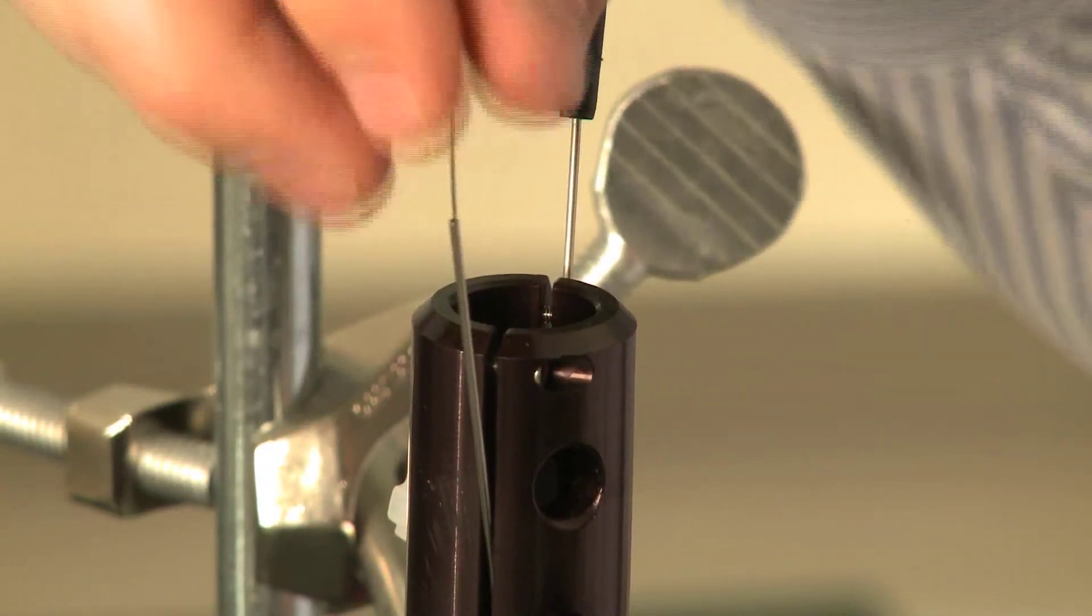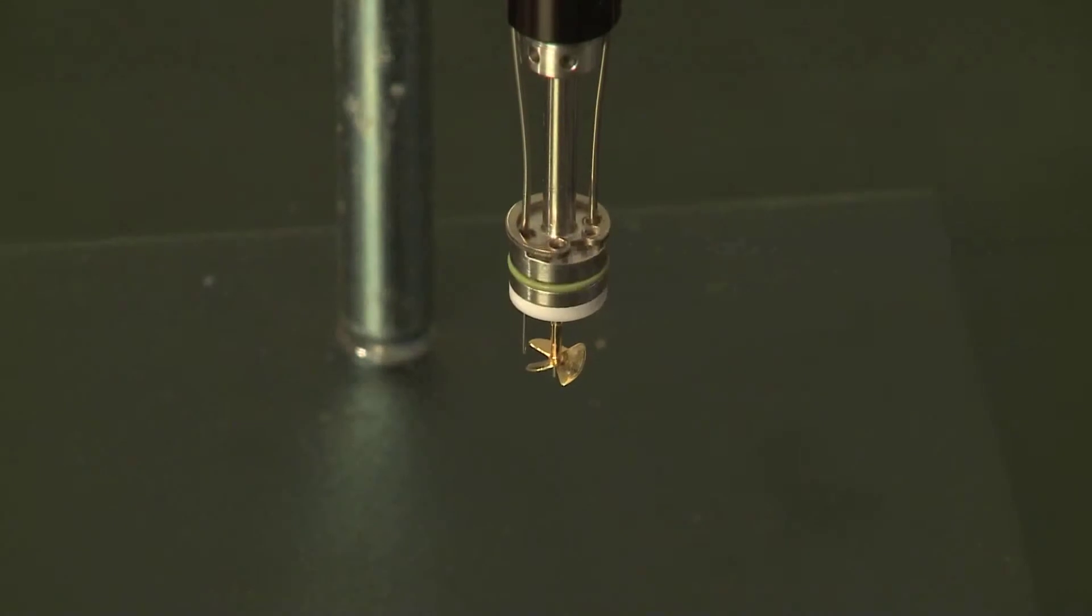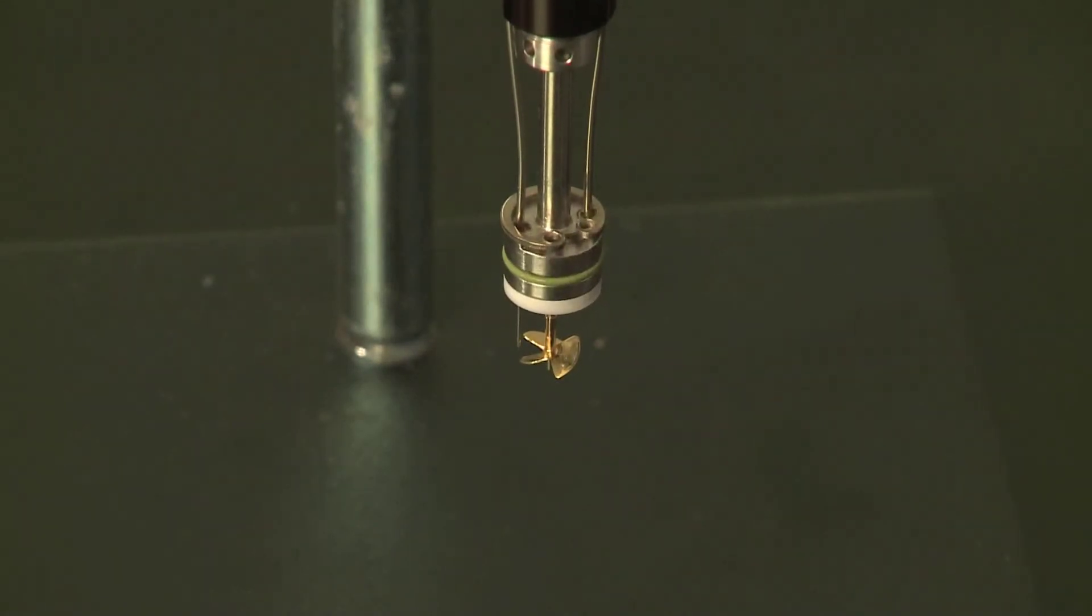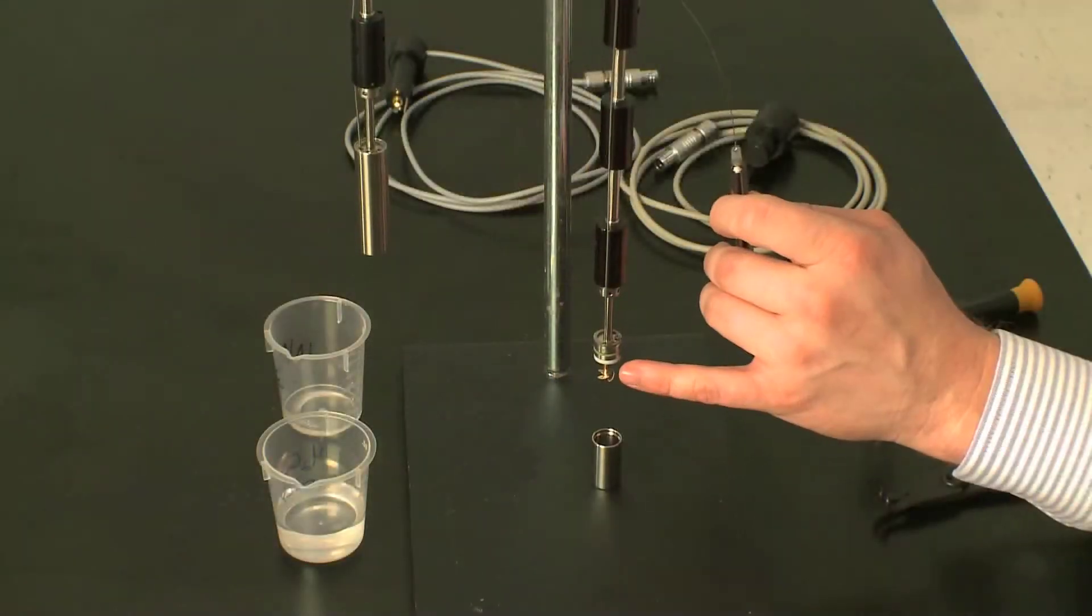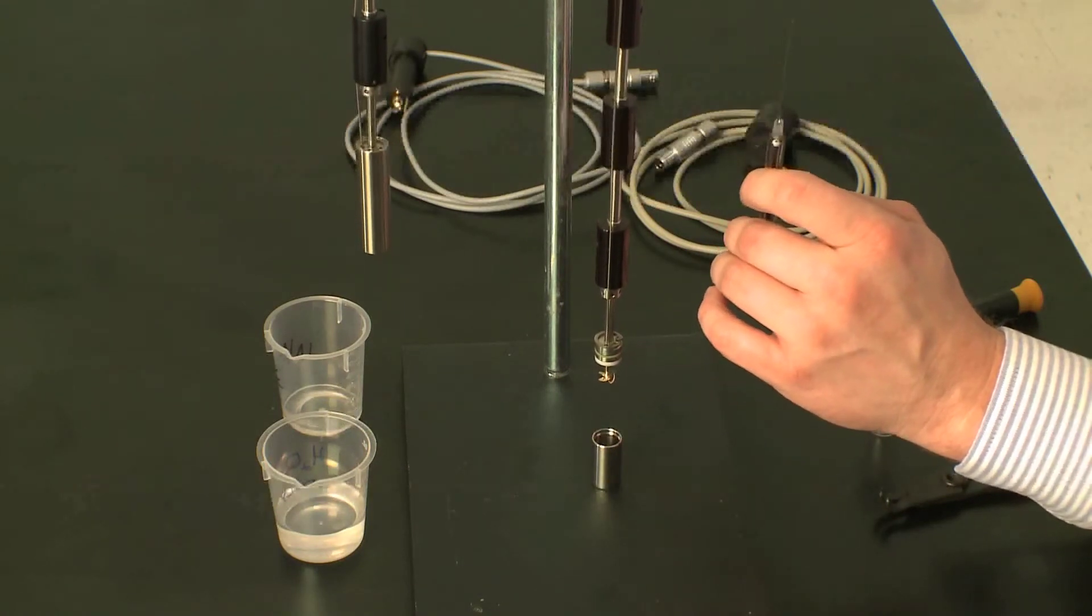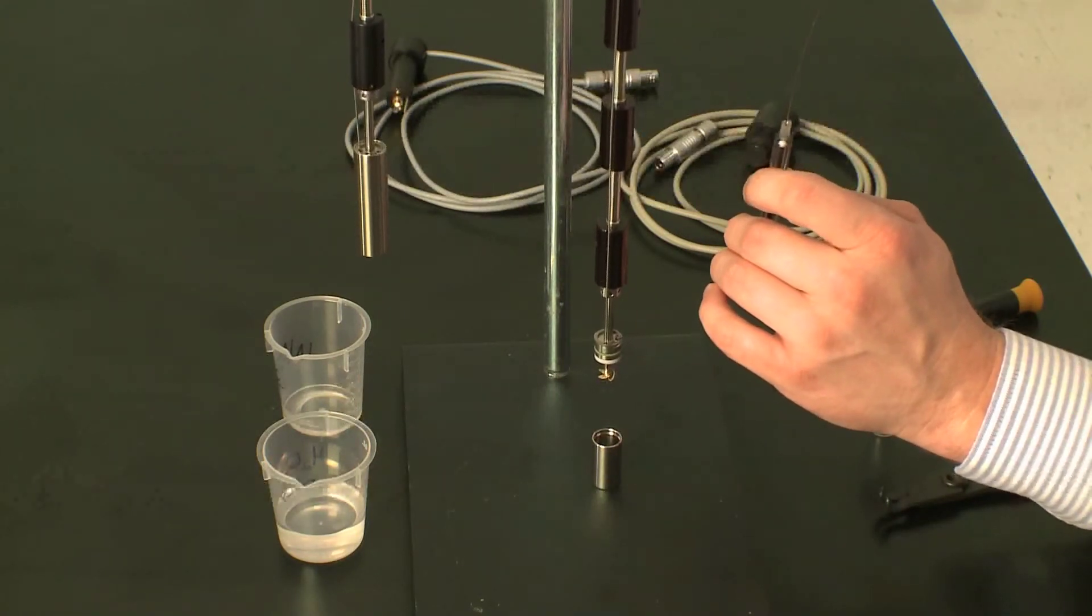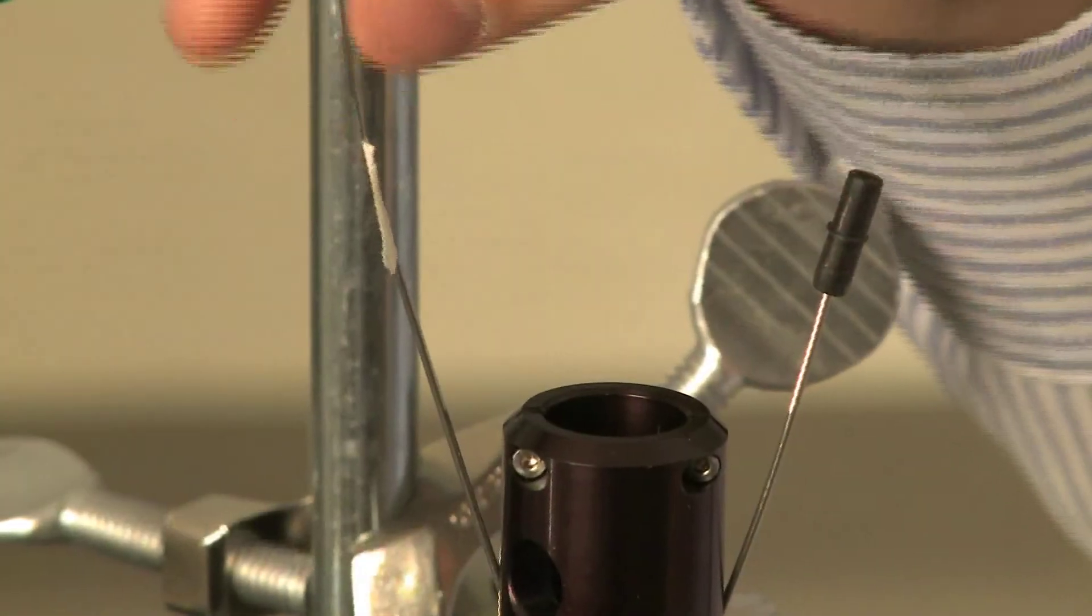I'm going to watch the height of the syringe cannula with respect to the stirrer. You see here, I'm about 1 to 2 millimeters above the stirrer. I have a piece of tape to mark the position.